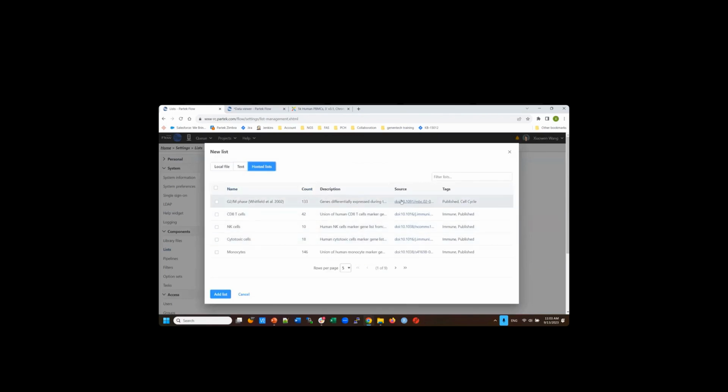Based on the literature, you will say this is not the standard. This is just from one paper here, okay? Just remember, everybody tries to build a database. You might agree with the database, you might not. So they're going to change all the time. This is what we have.